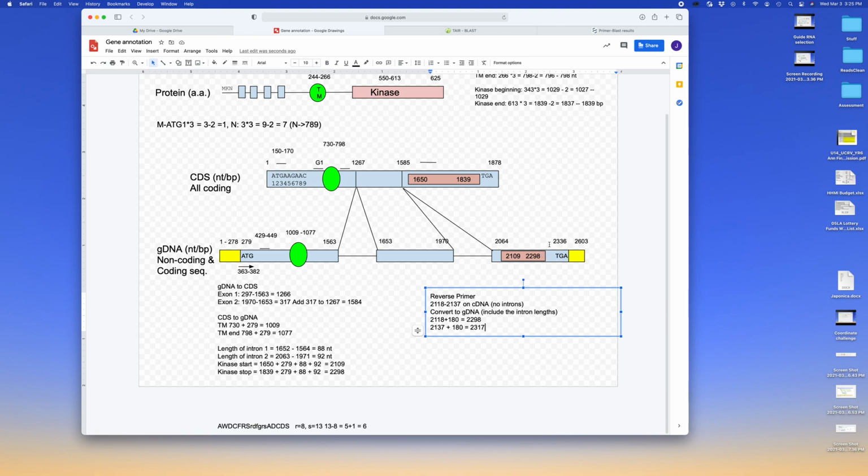Okay, so then let's go up to our diagram here. So that's going to be right in here. Okay, and that might be okay. If my guides are here and here, let's say if my guide is there, put the guide right there, and put a guide right there, then these two numbers might be fine because this is right next to the stop codon, right? So I would be seeing the primer would show up somewhere right in there.